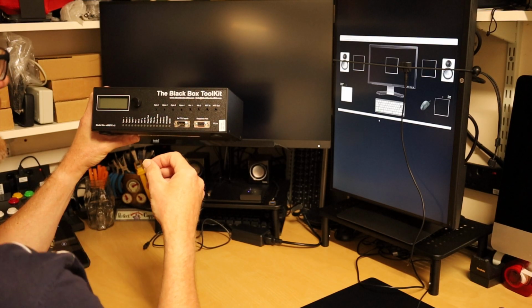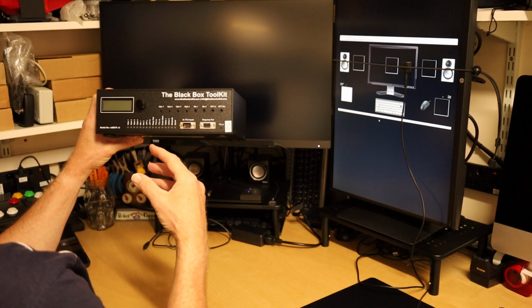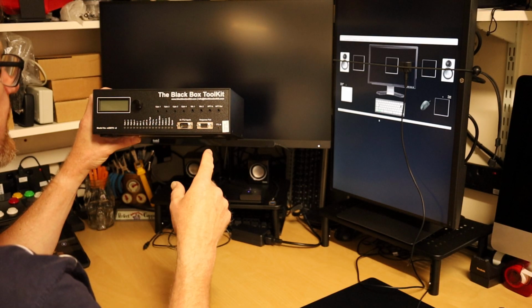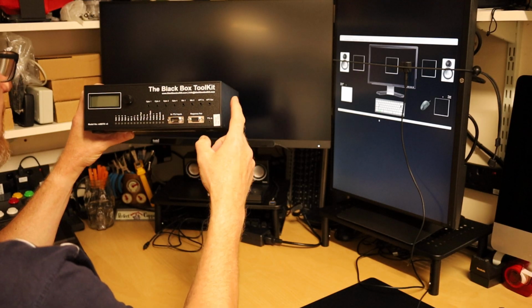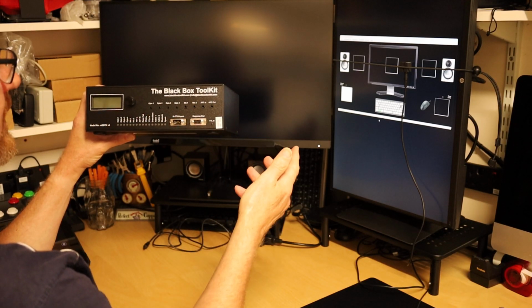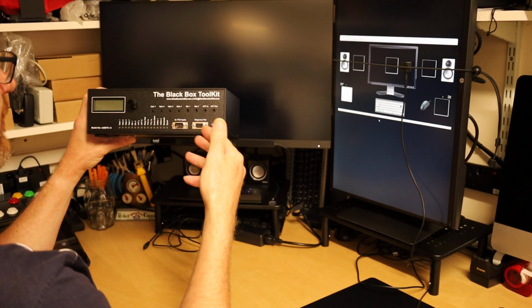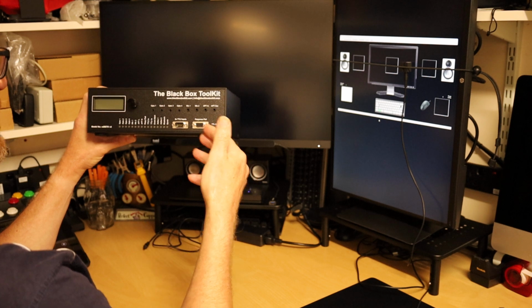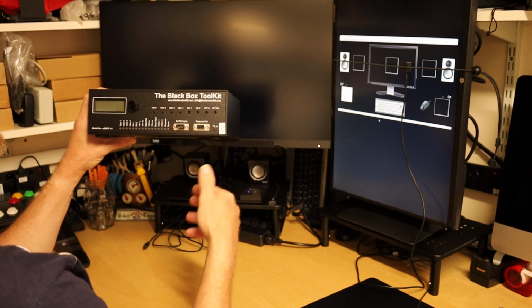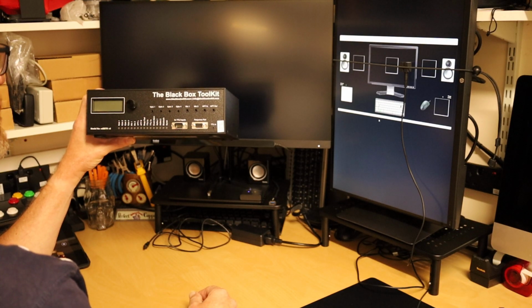The whole goal of this device is to event mark in real time, but also record everything that happens on its own independent timer, which is completely independent of the PC that you run it on, as it's got its own RAM. Once it's told what to do, it'll go away and do it and record all the timing data and everything that happened on its own RAM and then upload it when it's finished, in short.